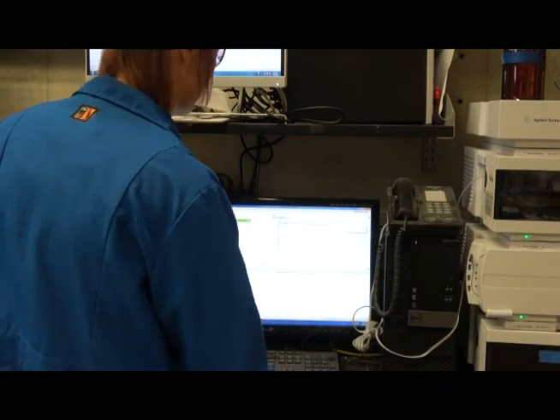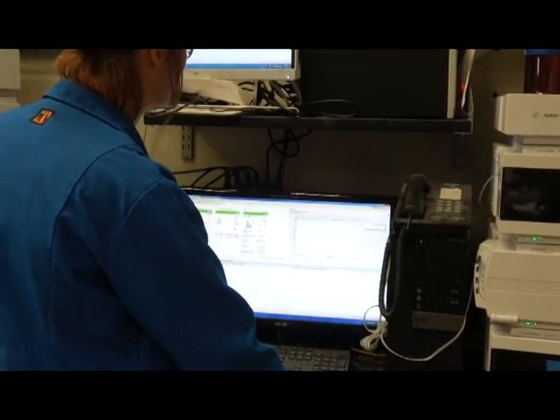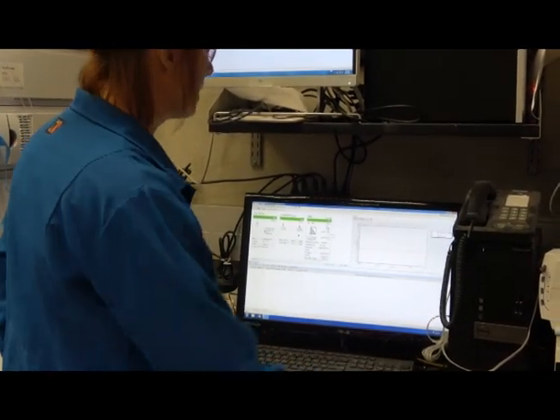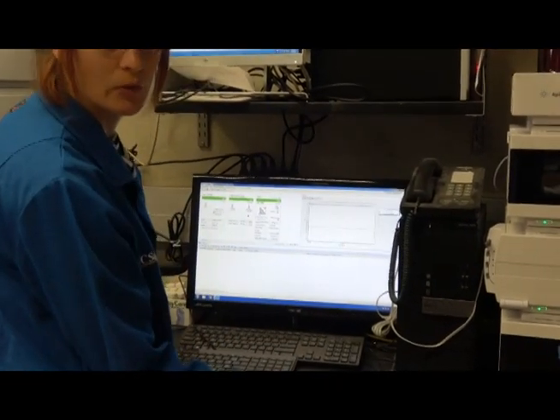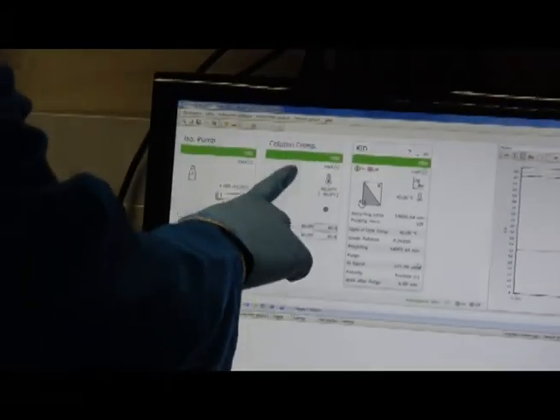But everything else is the same. You always right-click whenever you want to change something, and then change it in the methods section. Everything has been turned on already, so we are at our right flow rate, the one milliliter per minute, the right temperature.